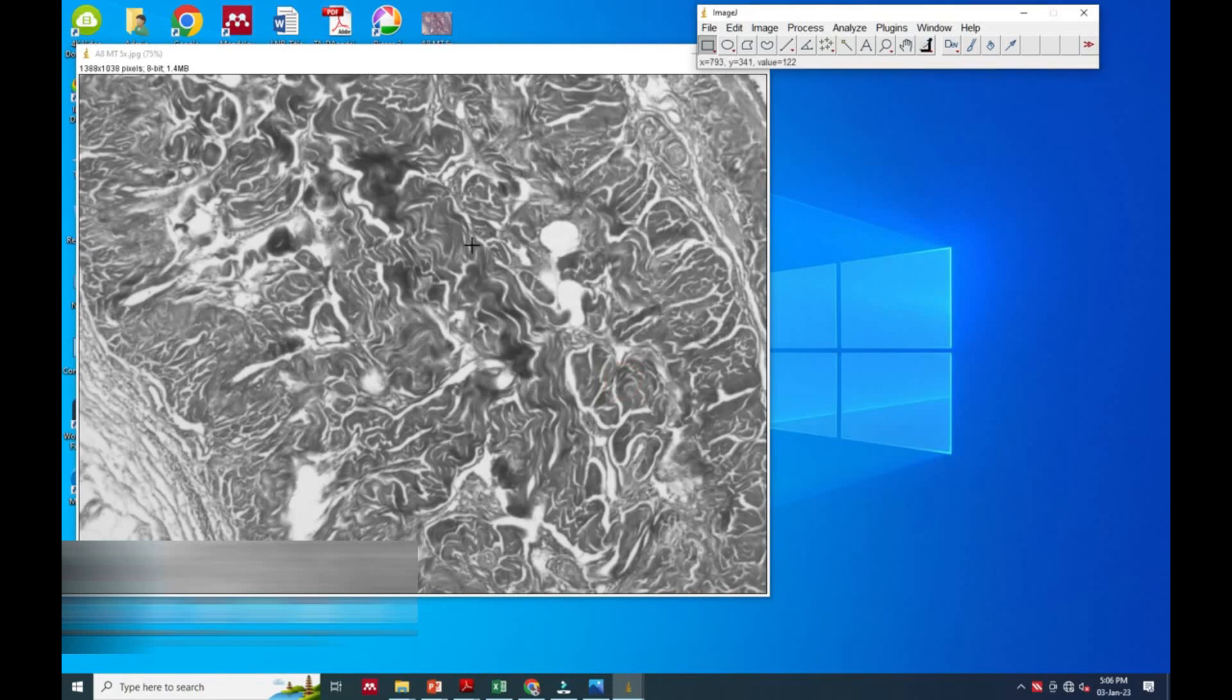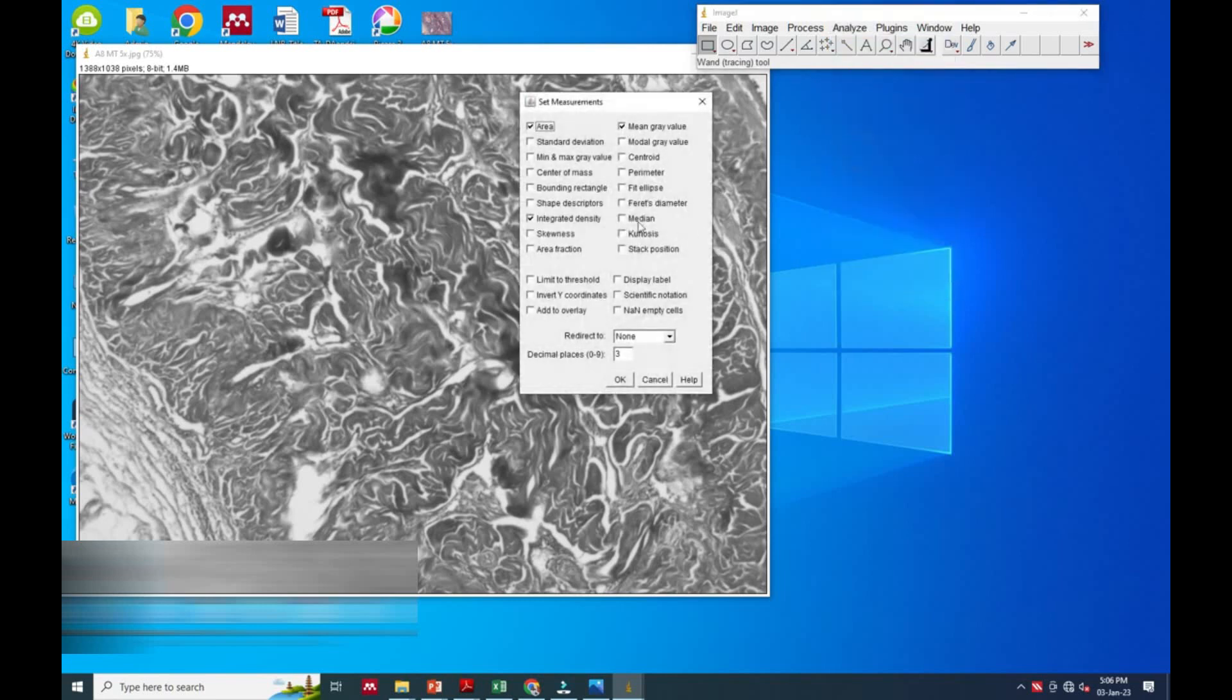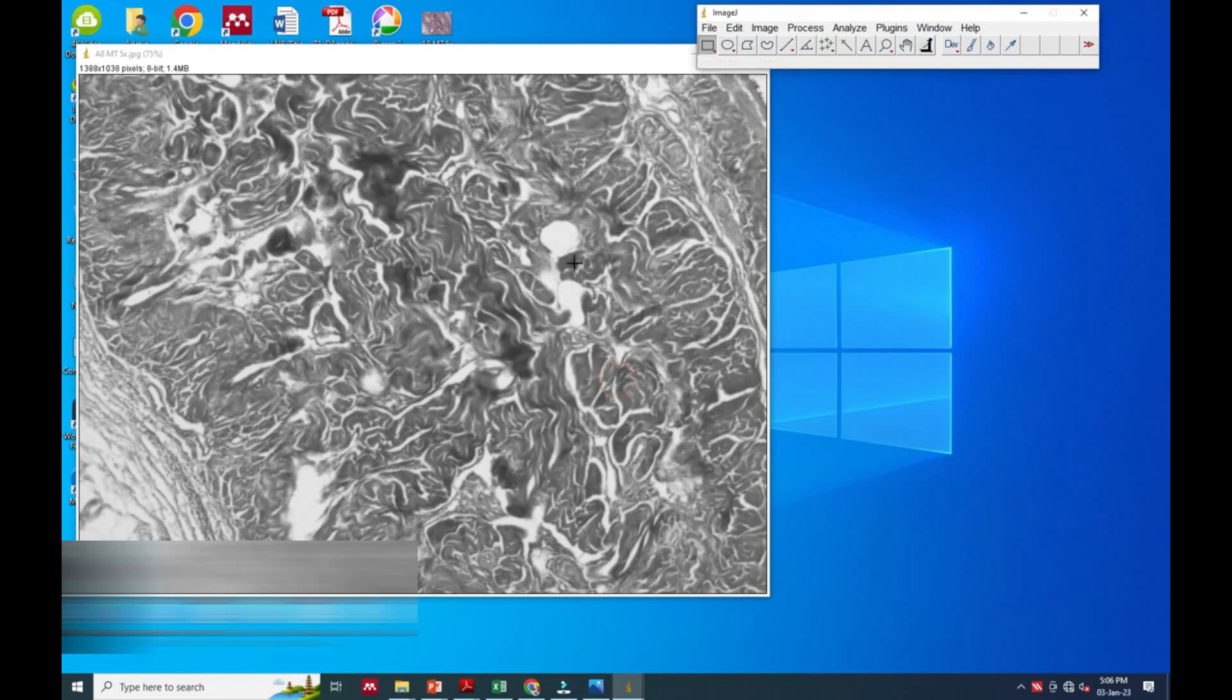After this we will go again to the Analyze option. Here it has given one wrong selection I have marked. We will go for Area and Area Fraction only, and after this we will go to the Image section.